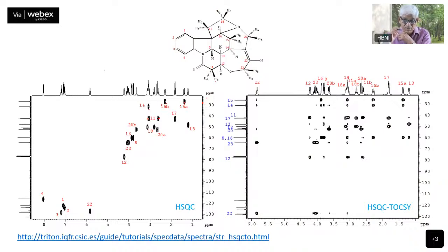and 11B. And then at nearly the same place, you also have this carbon 17. The 17 is here. The 17 also has two peaks. Probably the two are equivalent there. These two protons are equivalent there. Therefore, they are having the same place. They are not showing two different peaks. So depending upon what the chemical shift equivalences are, you will see different ones.